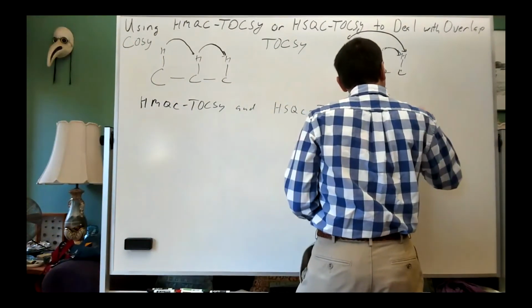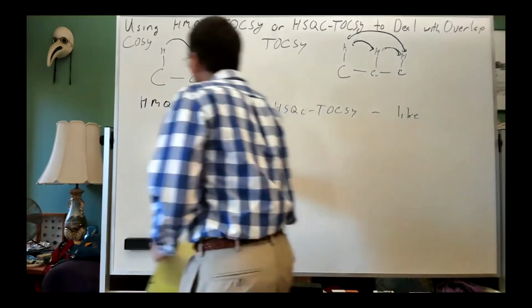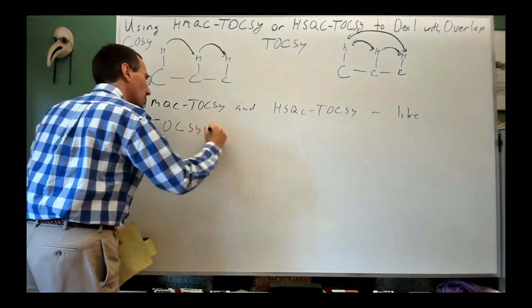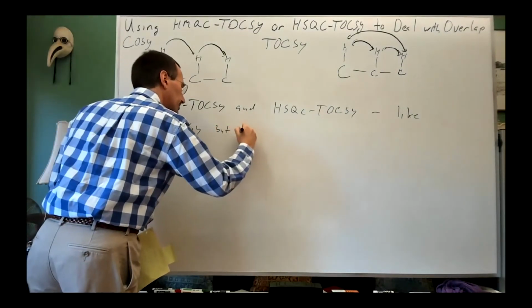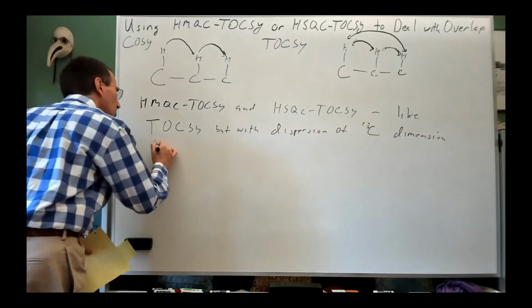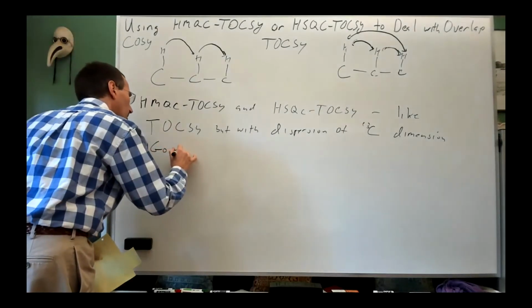So it's sort of like TOCSY, but with the dispersion of the carbon dimension. And so what this is good for specifically is overlap.